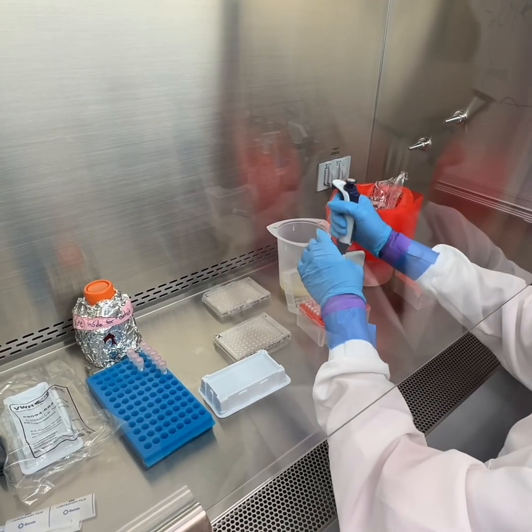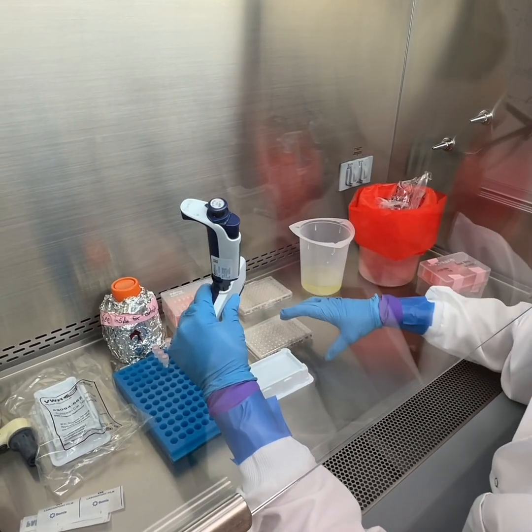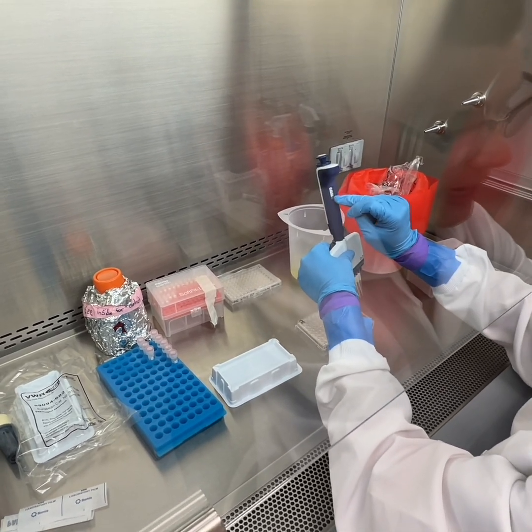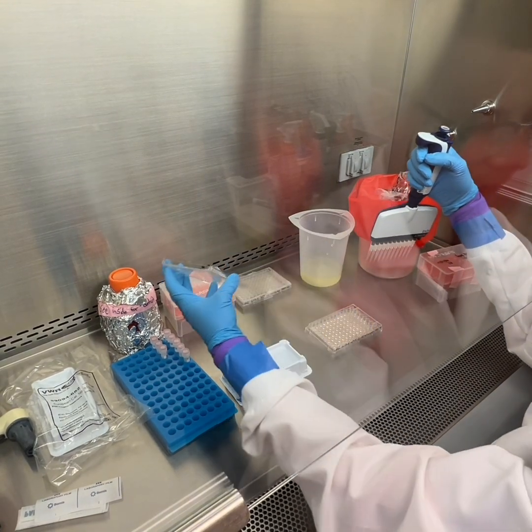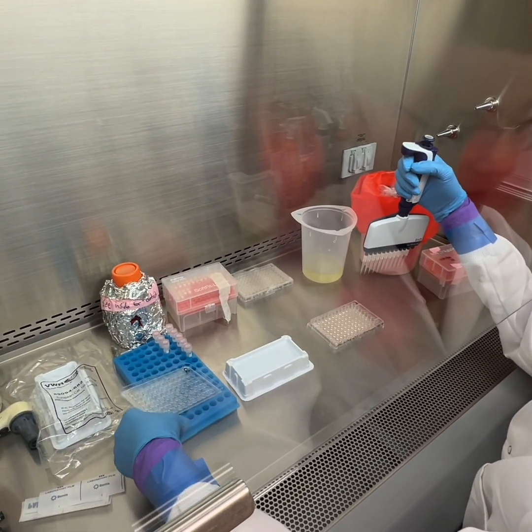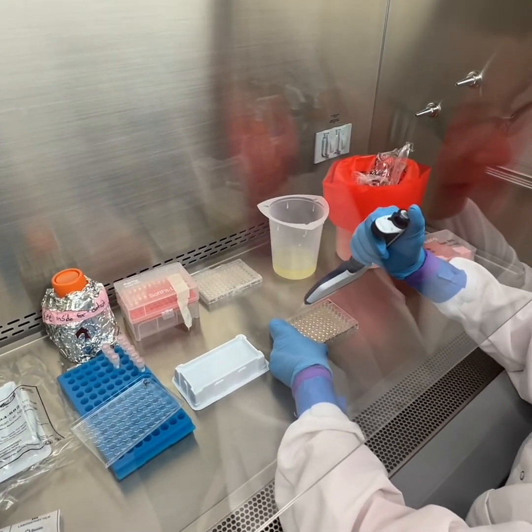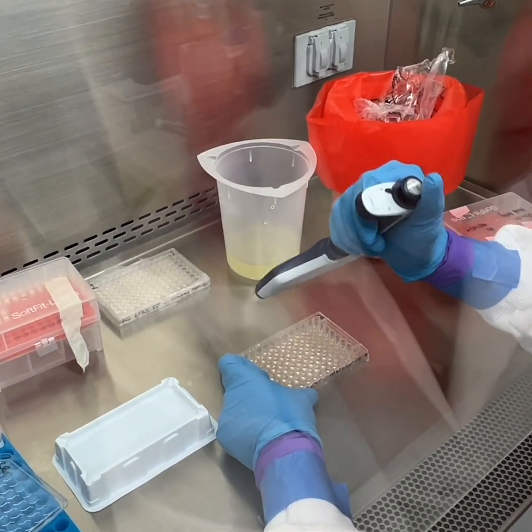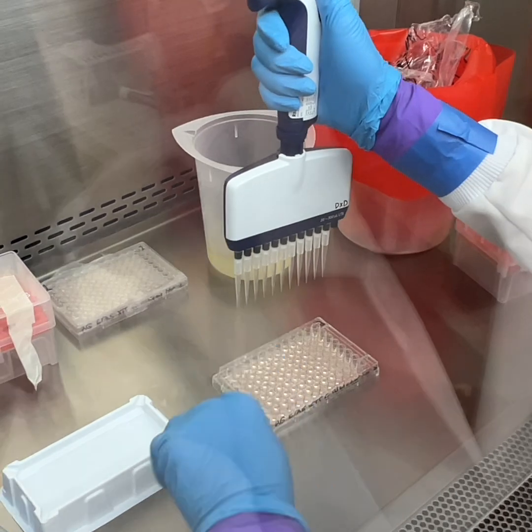All right. So there should be about 80 microliters of soup left in here, and so we have this set to 80. You'll see what I'm talking about: it's difficult to see what you're doing with it flat on the ground, and it's not very user-friendly ergonomics-wise either.